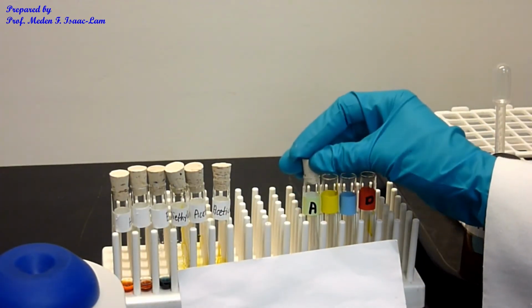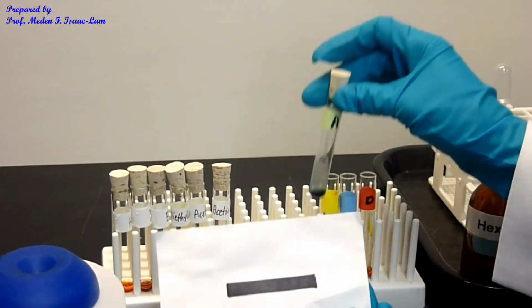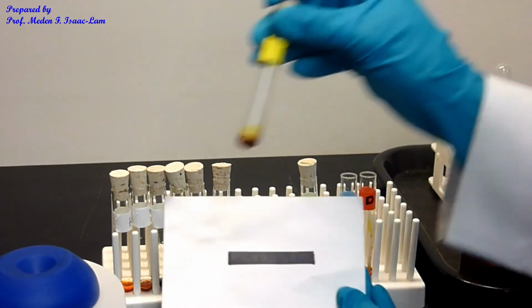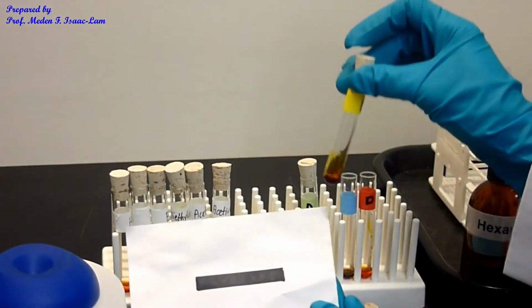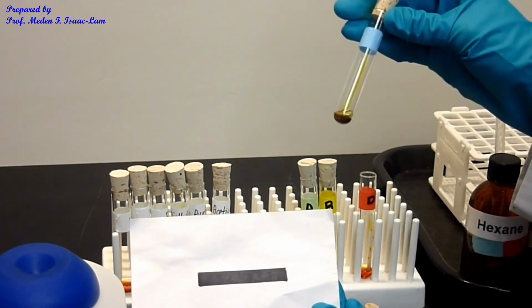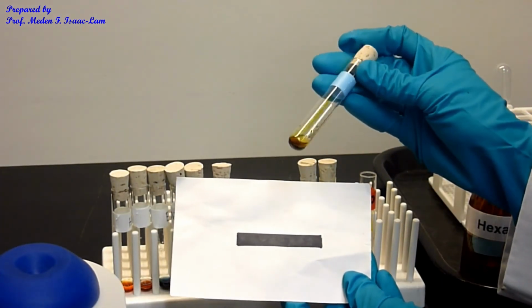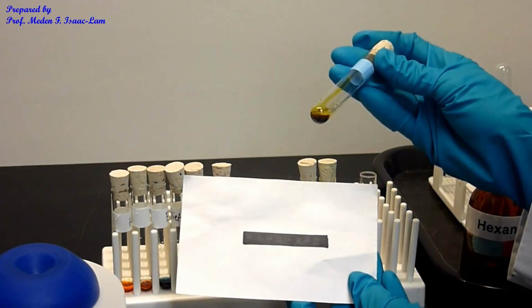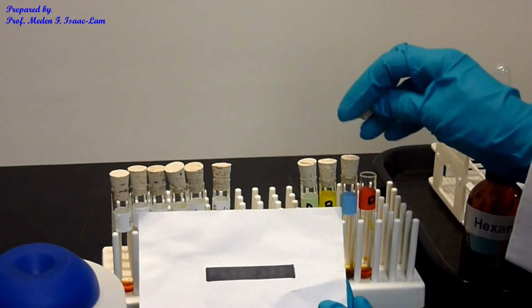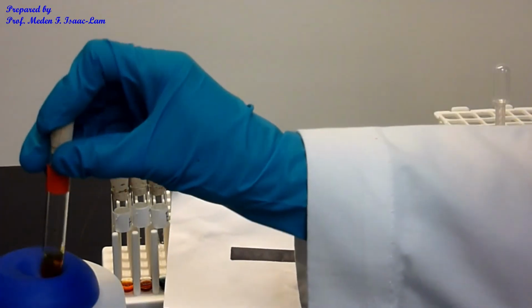So now unknown A, changed color, blue-green, and then unknown B, same, orange, and then unknown D, same. There's some kind of precipitation sort of at the bottom. It has some layer in it, and then D, same.